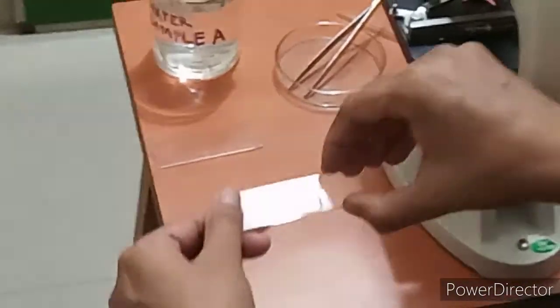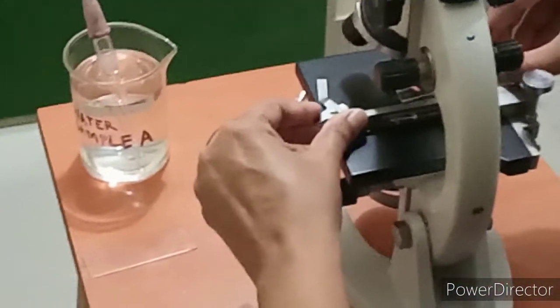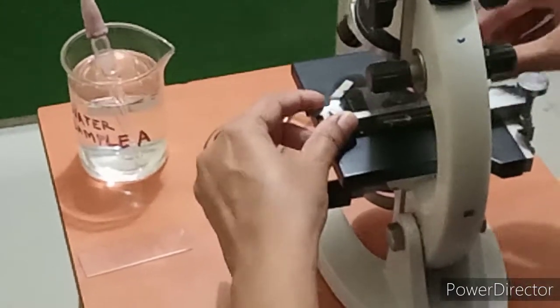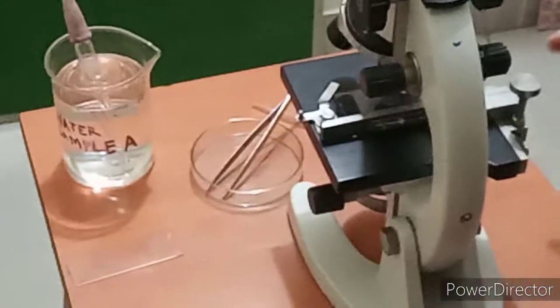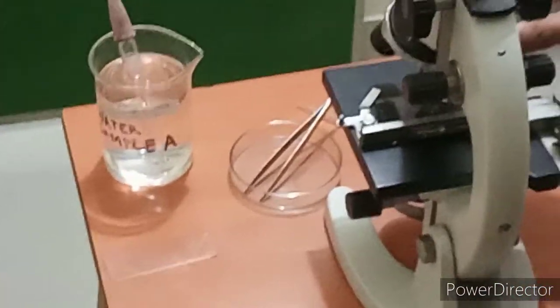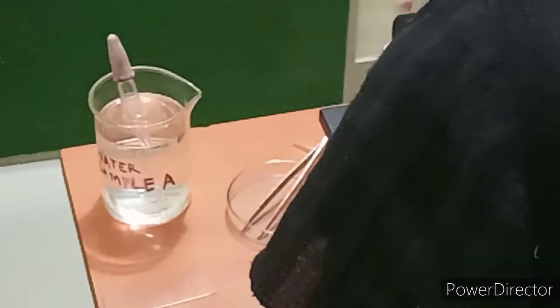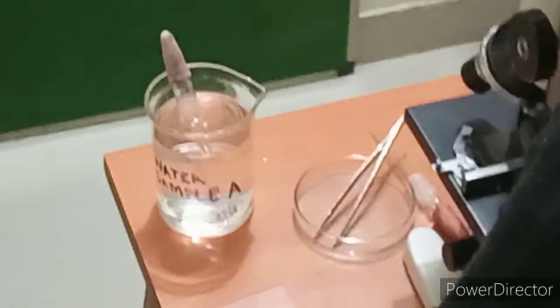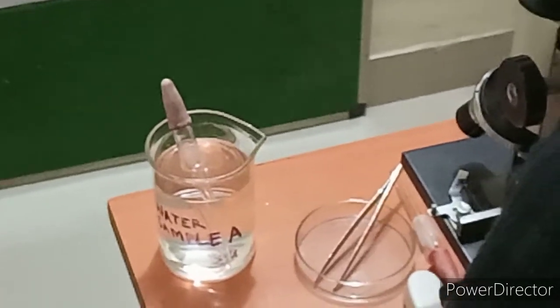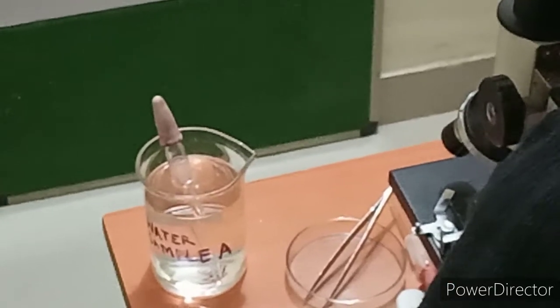So place it over the stage and clip it, and observe under the low power, that is 10x. Now here, as the water is clear, you cannot see any particulate matter or living organisms present in this.